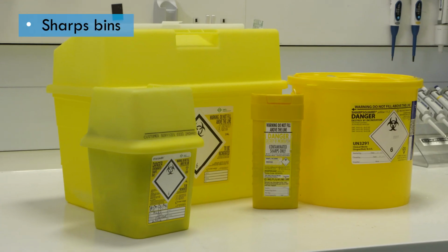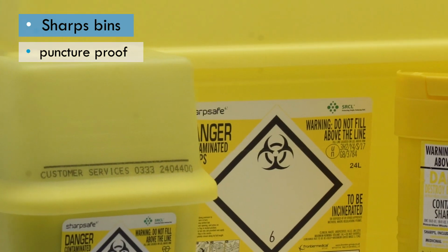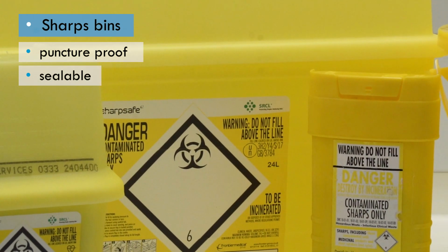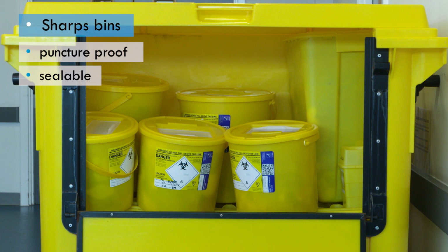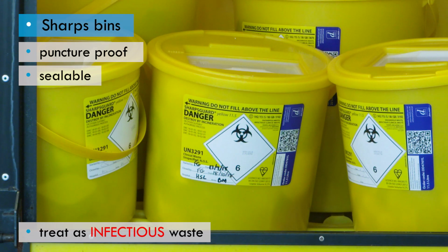Used sharps should be collected in puncture-proof containers, fitted with covers, that once sealed cannot be reopened without great difficulty. There are many specifically designed sharps bins on the market in various different shapes and sizes. Once used, these containers should be treated as infectious waste until they are autoclaved. Under no circumstances should sharps waste be treated as normal laboratory waste.